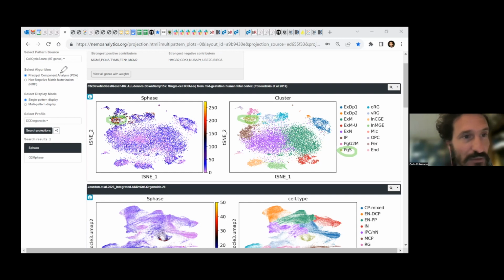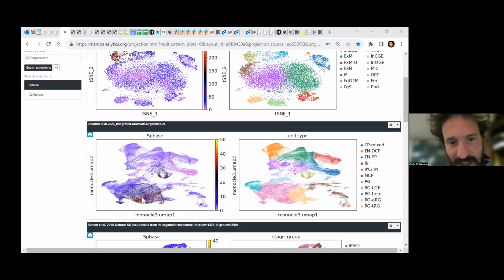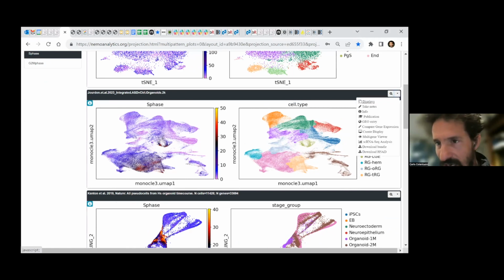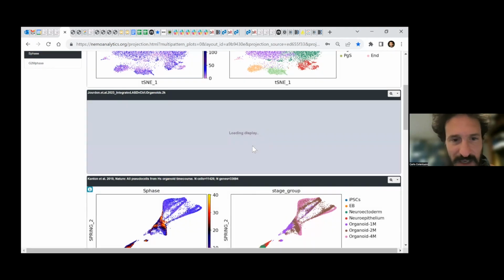So now we're looking at this S phase list of genes across the single cells here. And in Alex's data, this is kind of cool. There are two different areas where it looks like there's a cell cycle going on. These are just the broad cell types. But there's a clear S phase going on down here and a clear S phase here. While we're looking at the other data, I'll pull up a different display of this where we have the individual times on it.